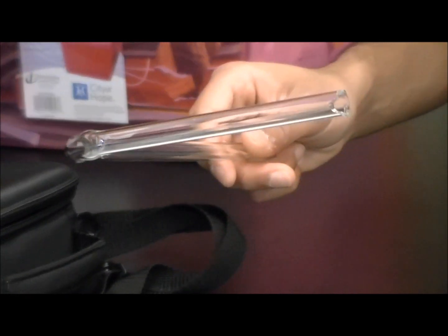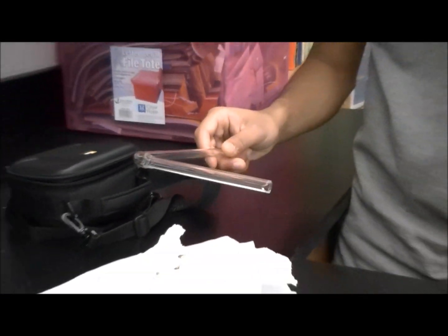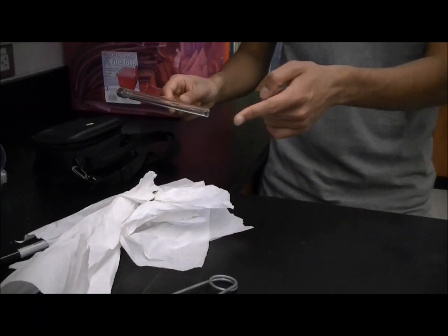I smell it too. I'm gonna put in the very edges of it so that it's not sharp anymore.